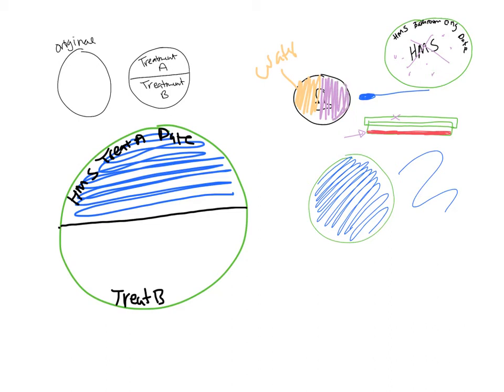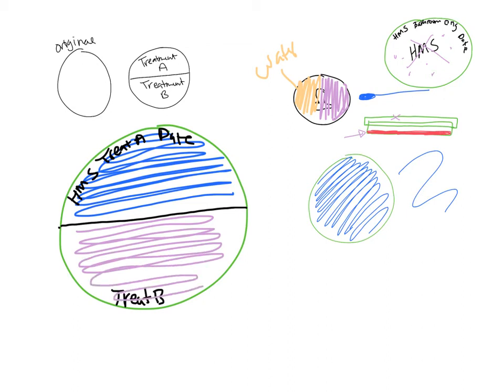You notice I didn't treat the same environment twice. You'll take your third swab, sample the environment, and then plate it, not crossing the line, on the other half of the plate.